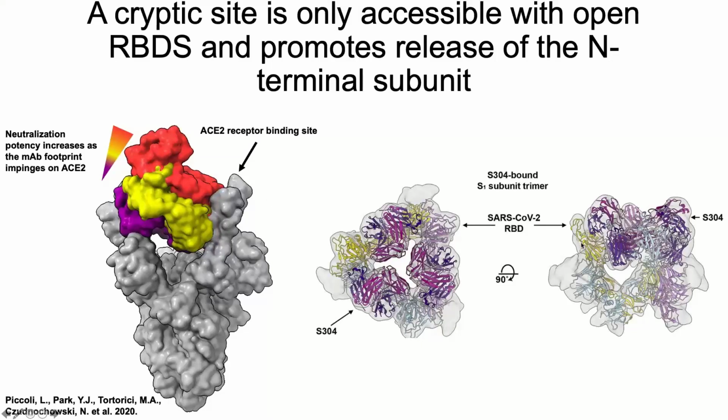And so you can see the trimer of the spike protein in yellow, blue, and light pink, and then you can see where the antibody has really engaged on the top. And what's interesting to us is this is happening even though we have a 2-proline stabilized spike protein, really suggesting that these antibodies are driving and forcing the receptor binding domains to stay open and in a really unstable position, which is potentially another mechanism or way that they, quote, destroy the spike protein.